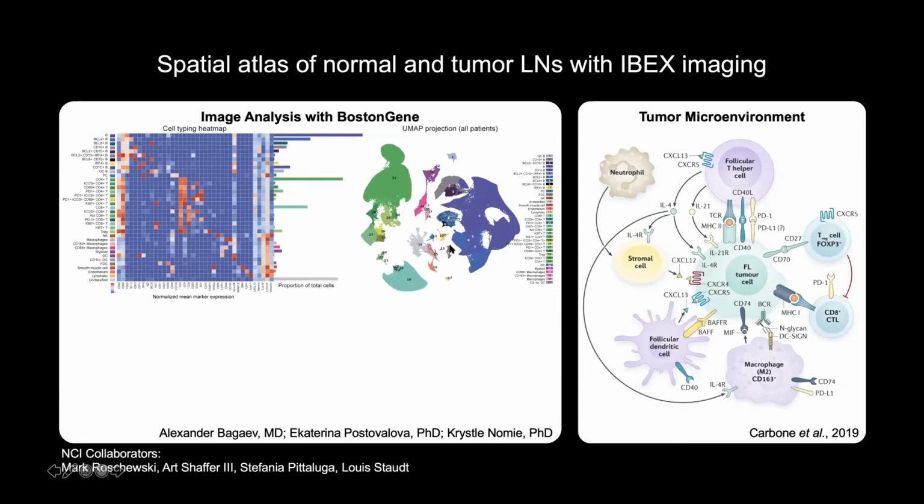And then for some cells, we can get some endothelial, we can get some lymphatics, but we're treating the stromal cell populations in a very different way, actually using the pixel-based approaches that were developed in the laboratory by Nishant, but also Michelangelo's group. Unlike single cell, we have really nice separation between CD8s and CD4s and a diversity of TFH cells that live here along with your Tregs.